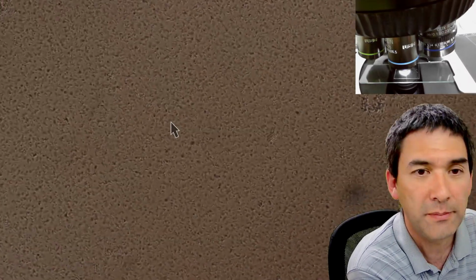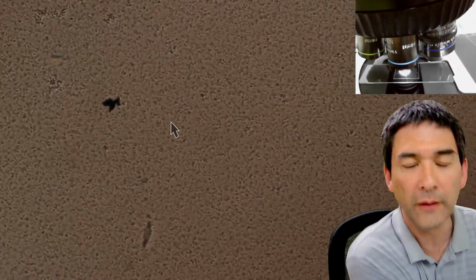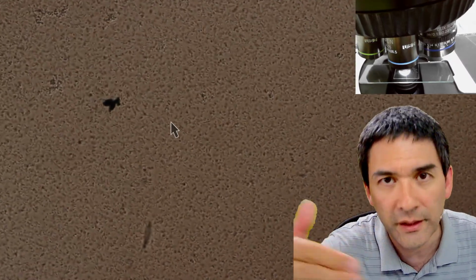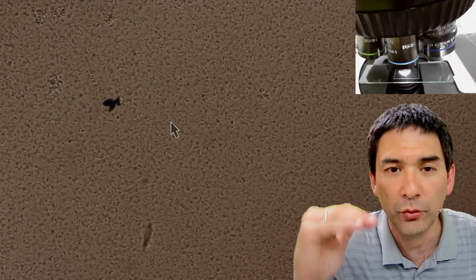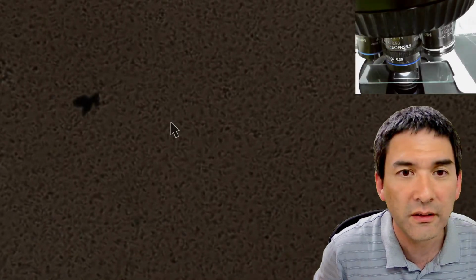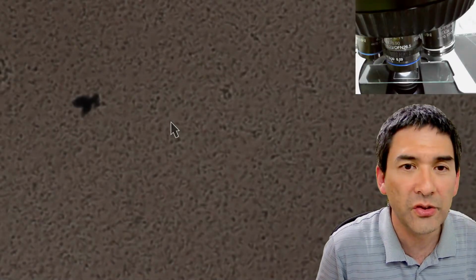So this now has the following problem: because of the liquid, of course there's movement, but there's also vertical movement. So it's very difficult actually to see the bacteria properly. So 60 times. Yeah. Let's open up the condenser a little bit here.